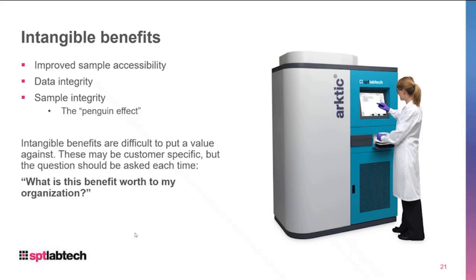Tangible being something that you can actually put a measure to, like cost savings or energy savings, and intangible being something a little bit harder to quantify, but provides a value that you can really push for in your business plan, or provides value that's necessary for your laboratory.